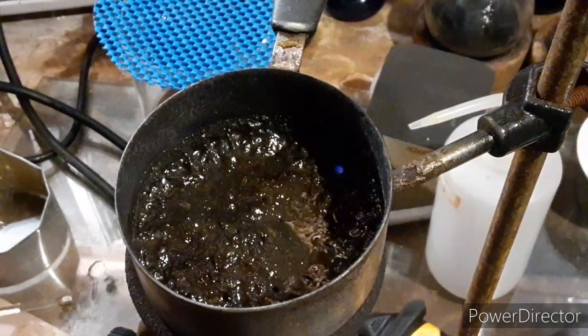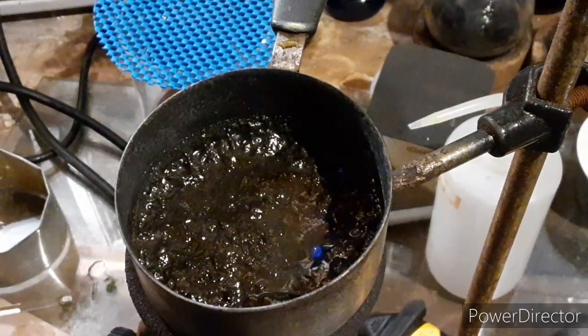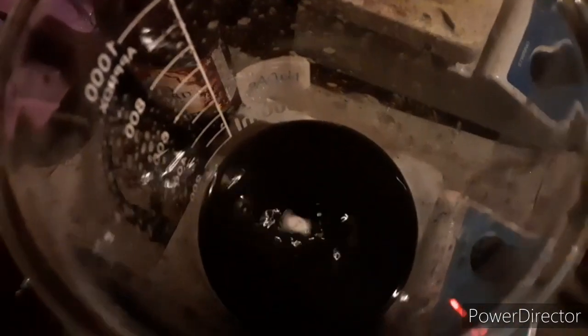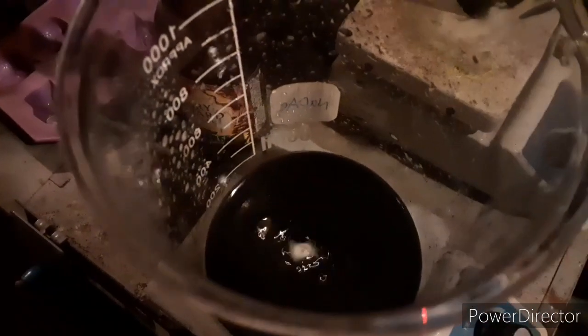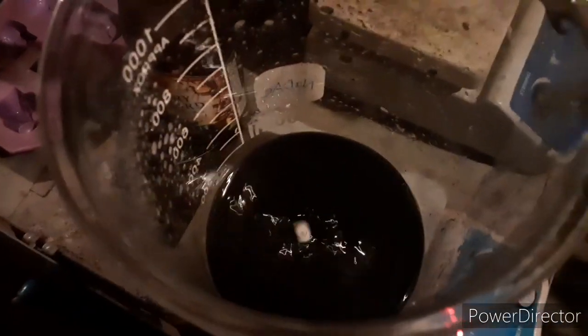After this, we want to partially cool it — not all the way — scrape everything into a beaker, and then extract the thiocyanate with ethanol heated to the boiling point. I'm breaking up the lumps in the ethanol right now. Once I get all the lumps broken up, I'll heat this up to just under the boiling point and then probably filter through some cotton to get rid of all the fine iron particles.